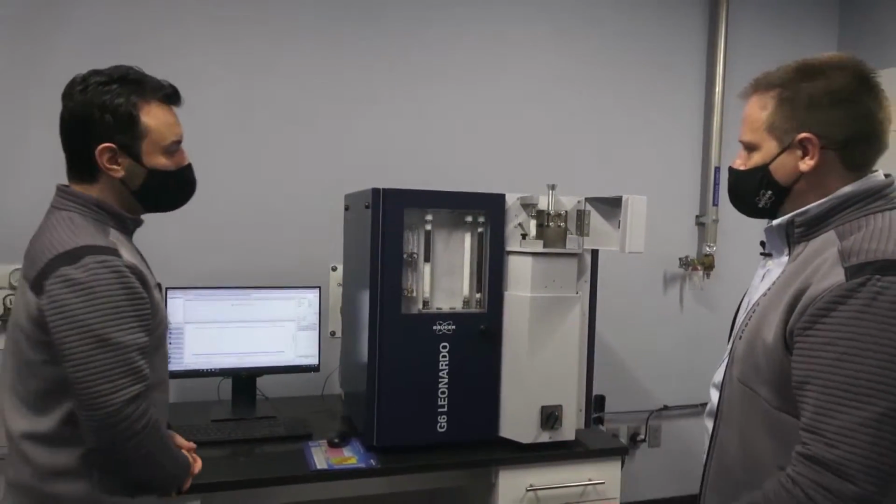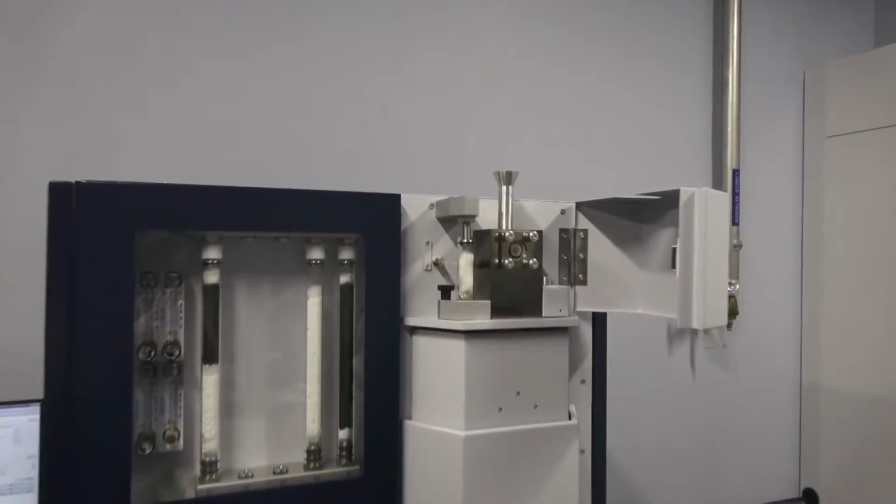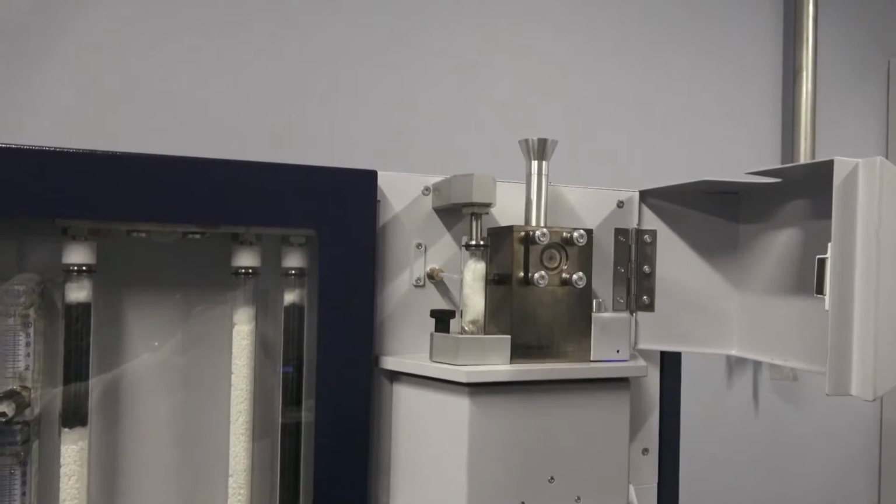Just like a pin. Okay, almost, huh? Yeah, I just saw it rotate, so I'm guessing that was it. Now it's in the crucible and it's already melted. In a few seconds, actually, it's already started.